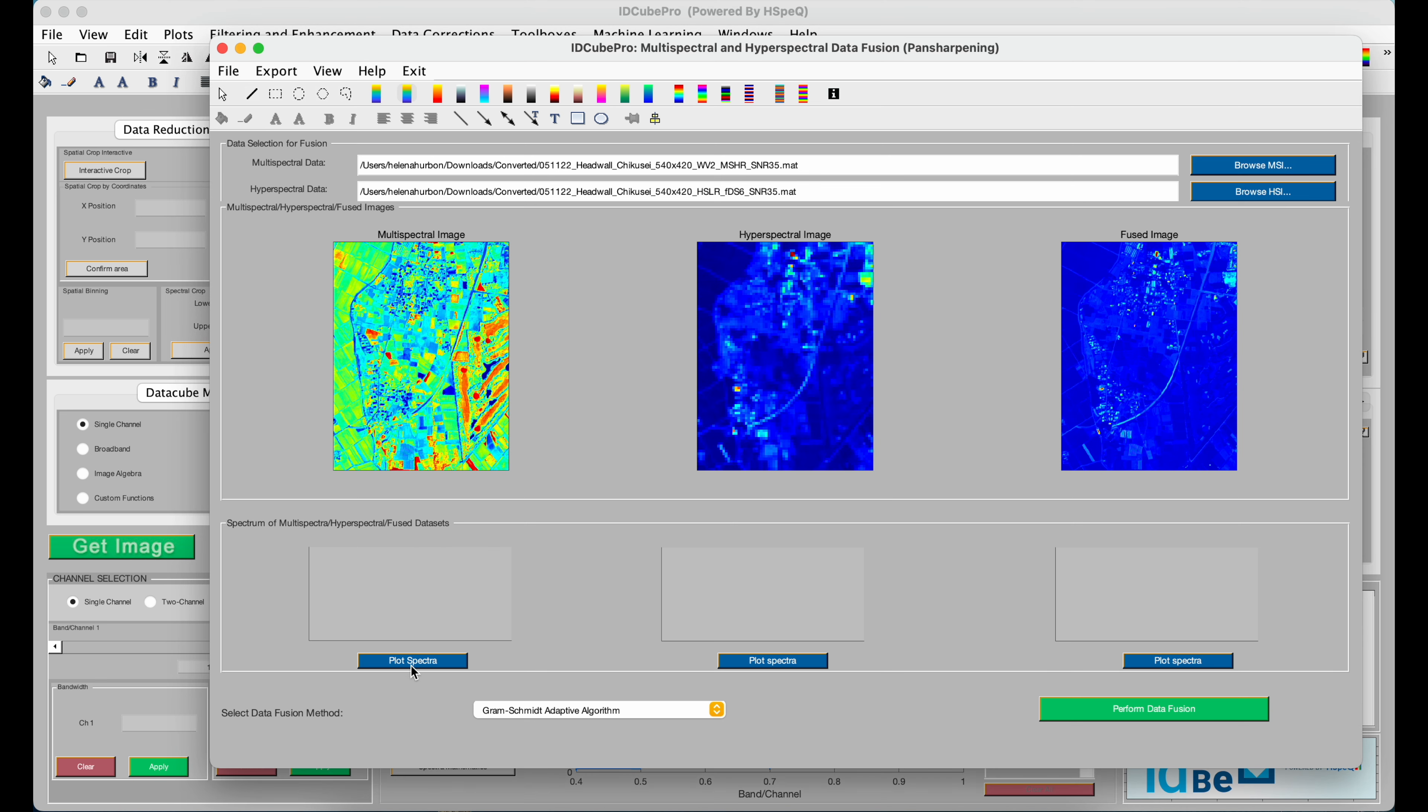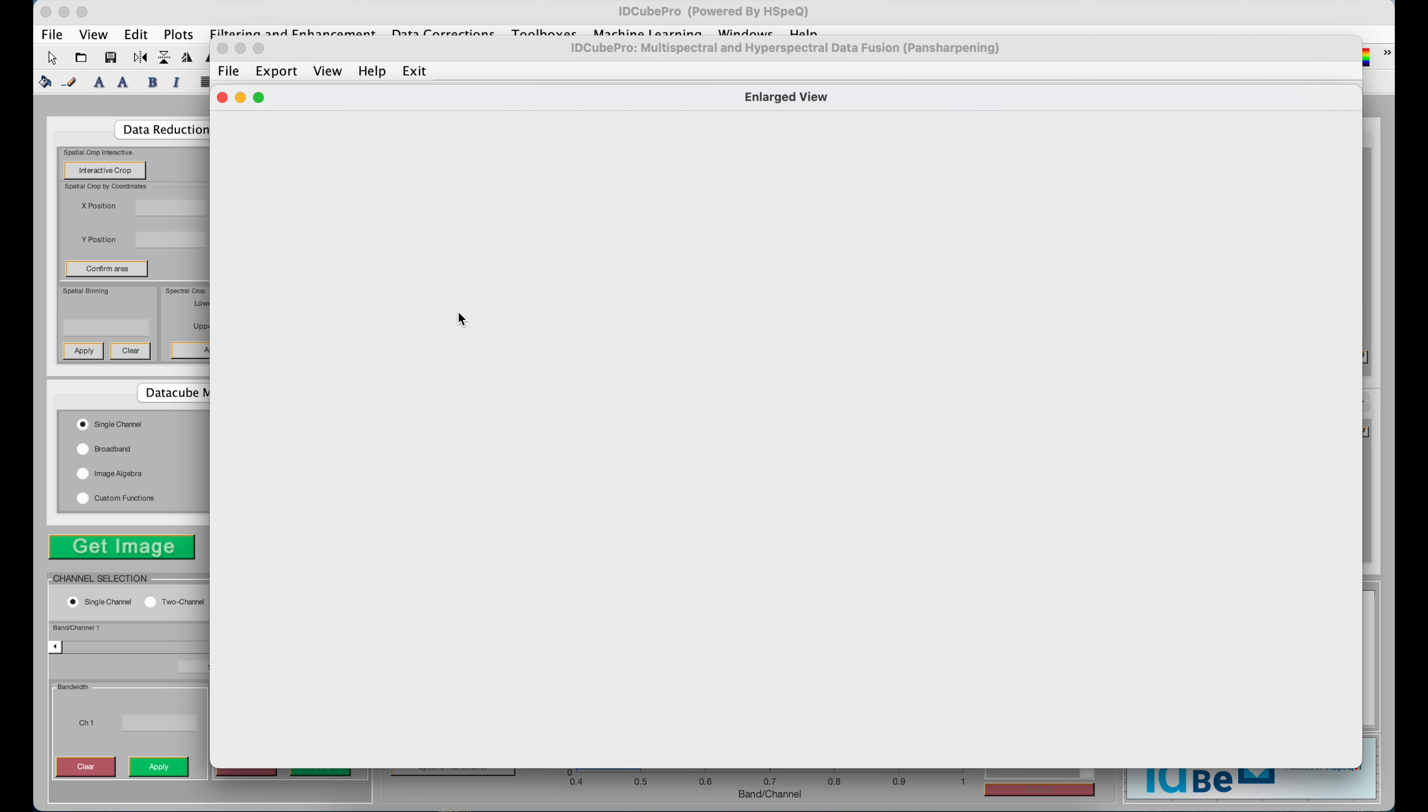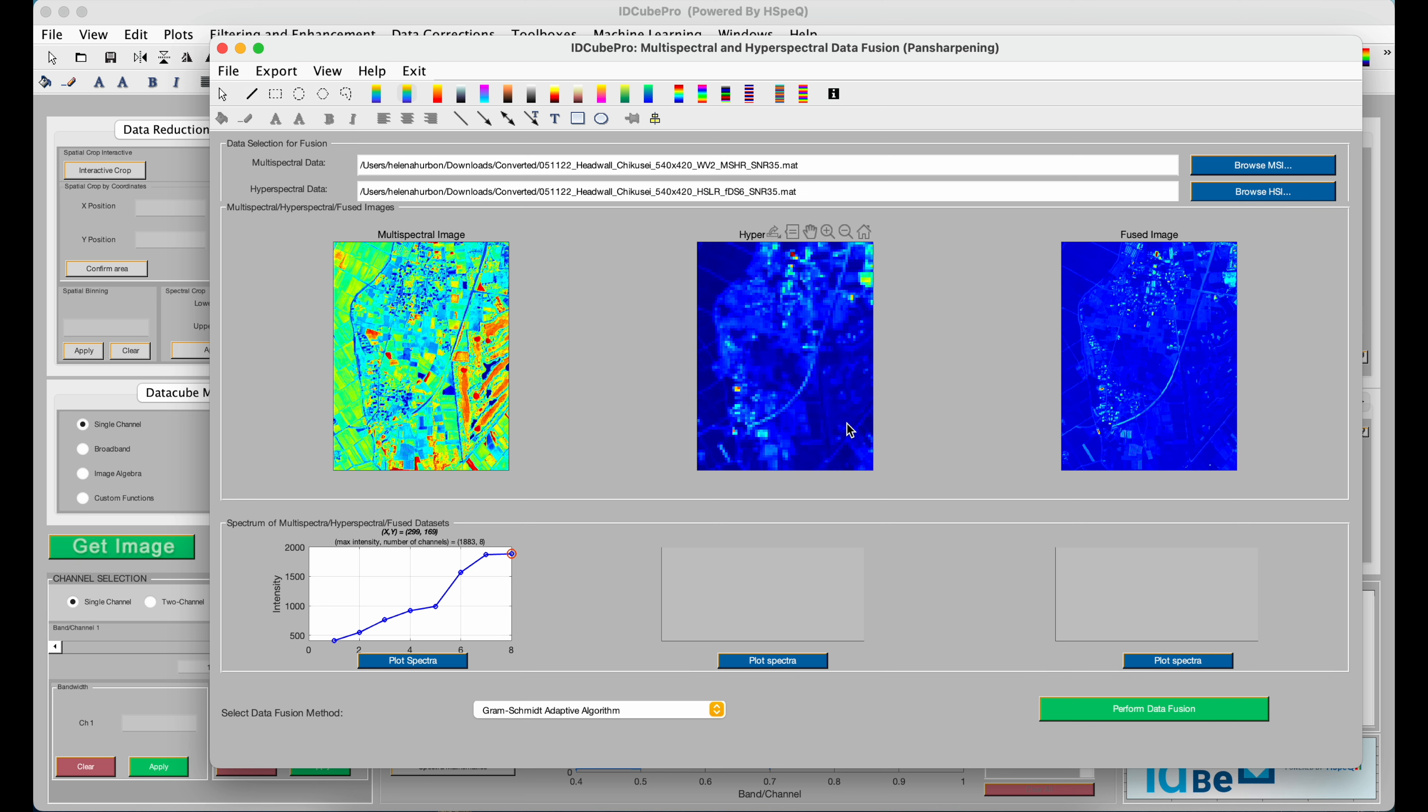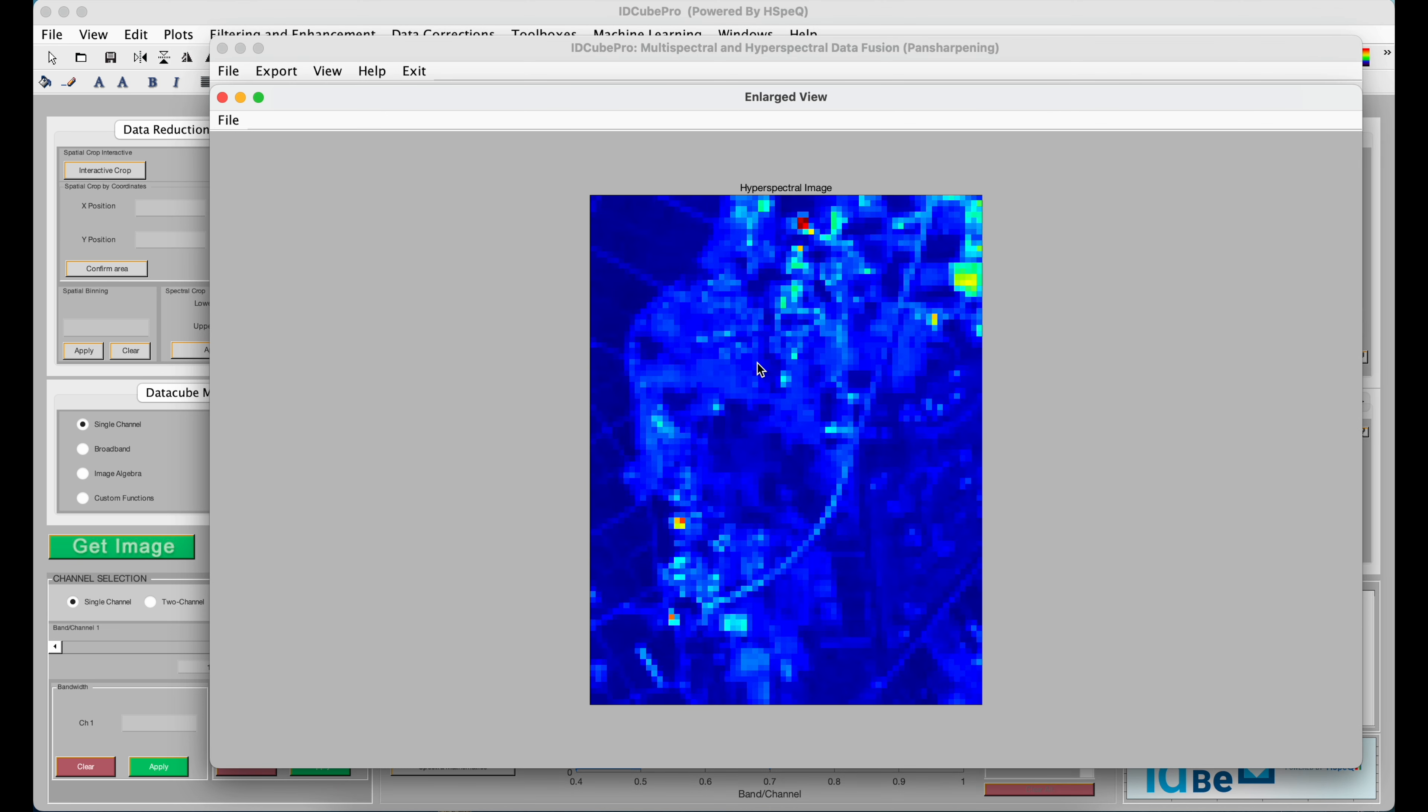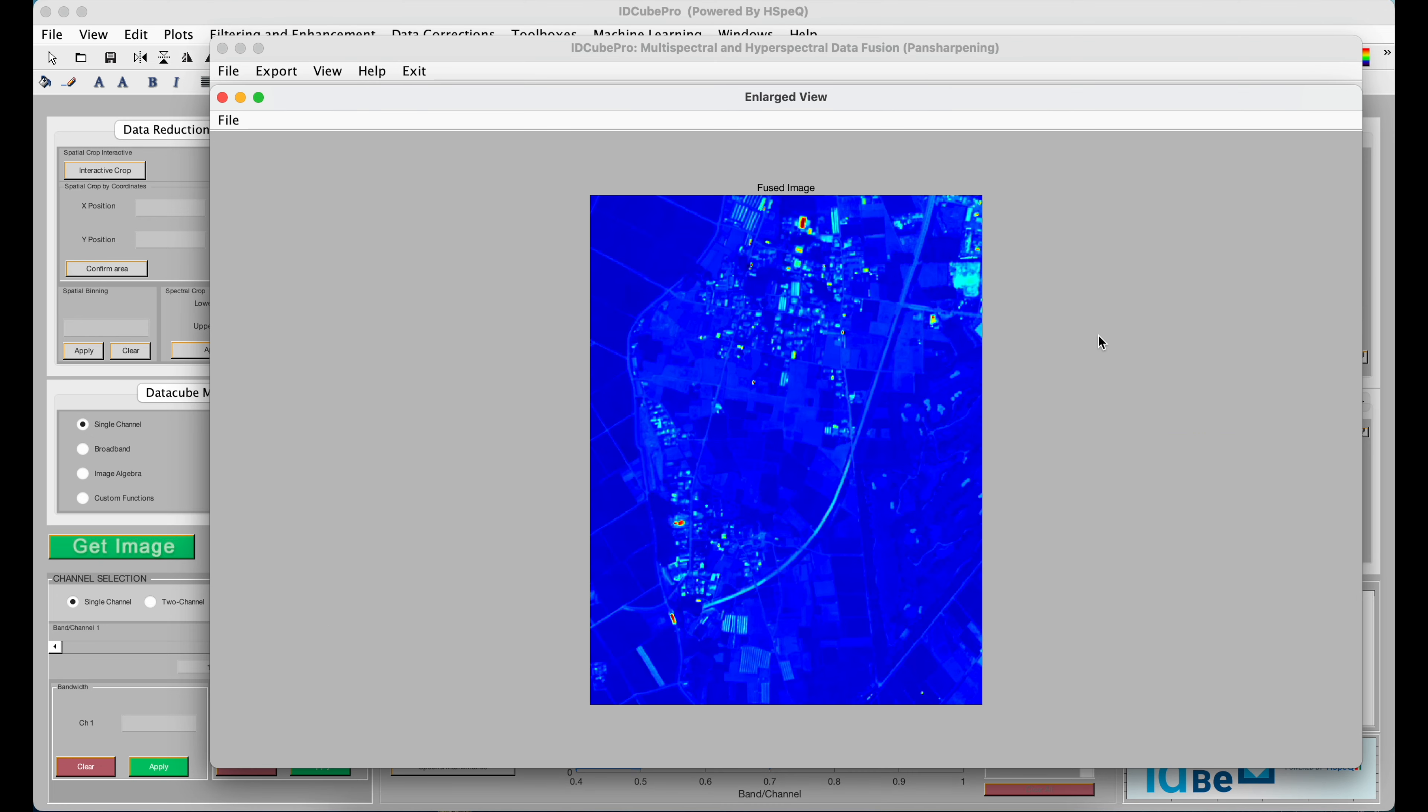If you click the Plot Spectra button, you can hover over each image to see what the spectra looks like. If you click on the image, it will open larger. And the same for here. And then the last one is the fused dataset, and you can see that this is both hyperspectral and has high resolution.